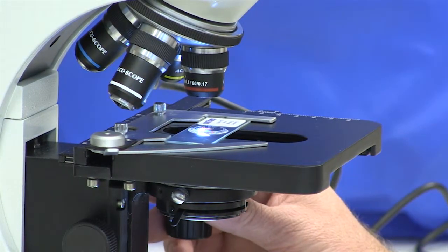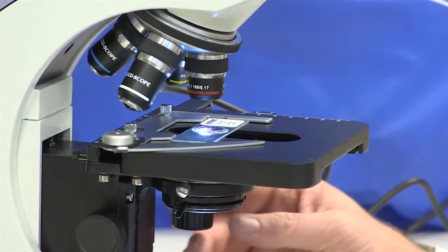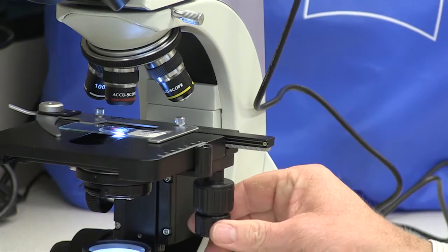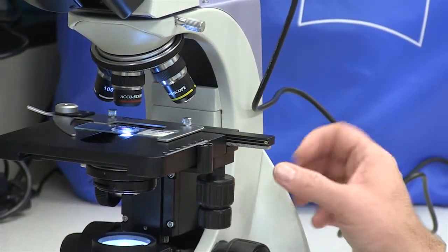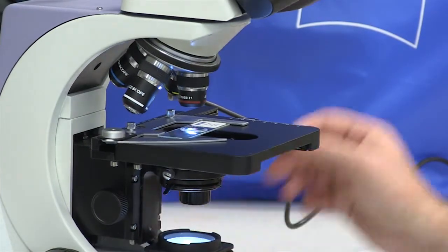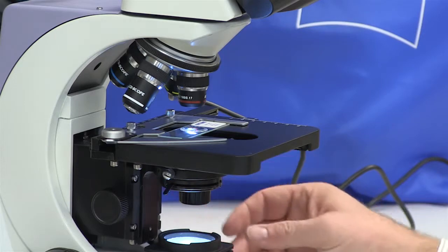Then I'm going to manipulate the mechanical stage knobs, which are on the other side of the microscope from you. I'm going to manipulate them so that the colored threads are in the center of the circle of light coming through the stage.